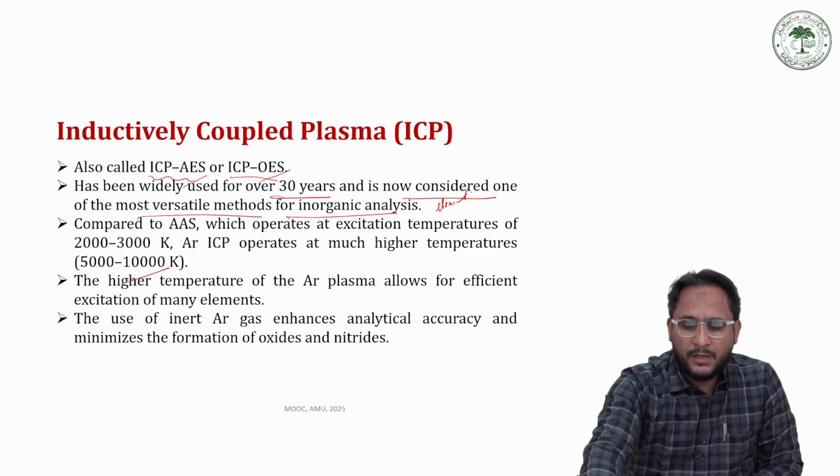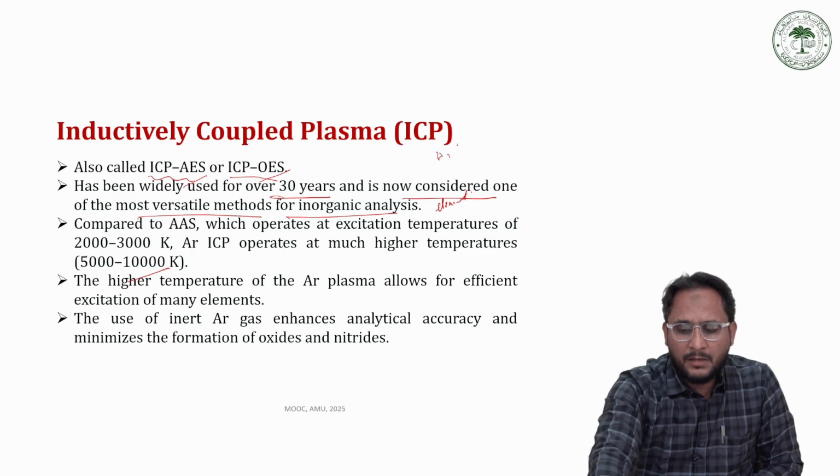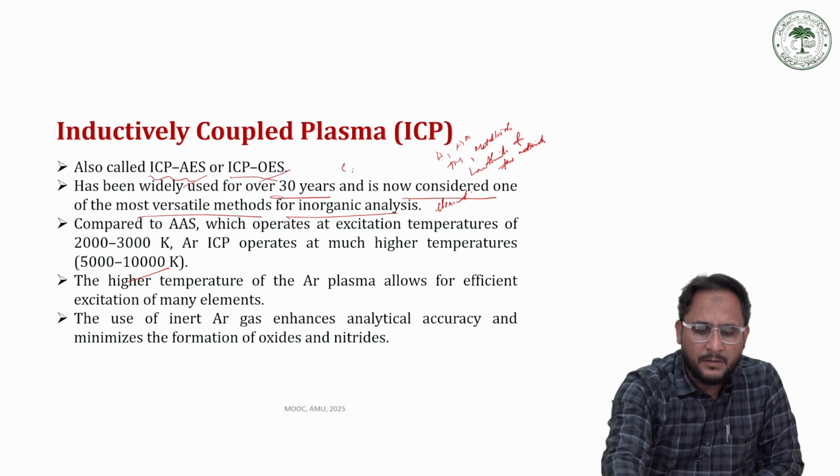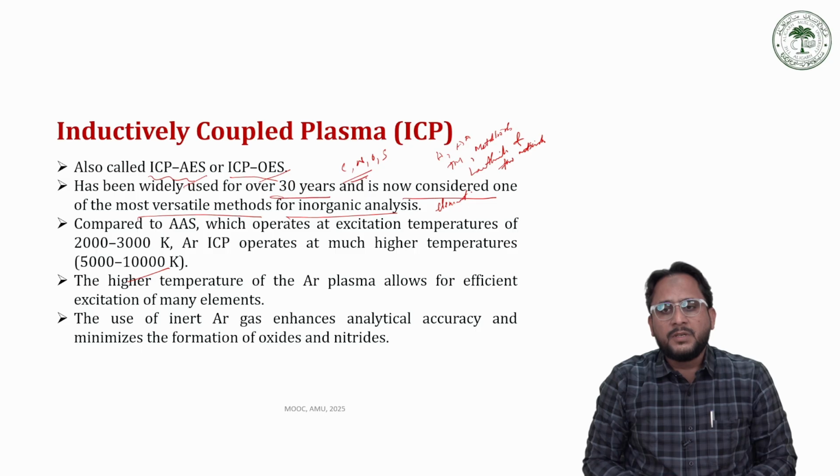With this technique we can analyze all alkali metals, alkaline earth metals, transition metals, metalloids, lanthanides and a few actinides. Even carbon, nitrogen, oxygen and sulfur, these non-metals, can also be analyzed by this technique.